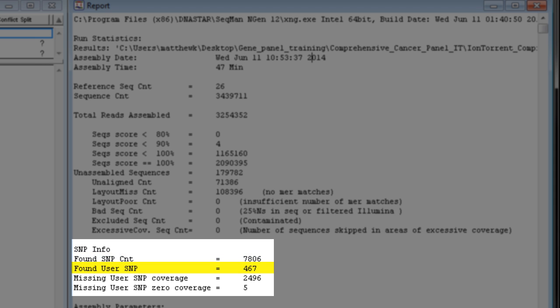The found user SNP value shows the number of SNPs in the VCF file that are also present in the assembly. The missing user SNP values show how many SNPs from the VCF file are not in our assembly.